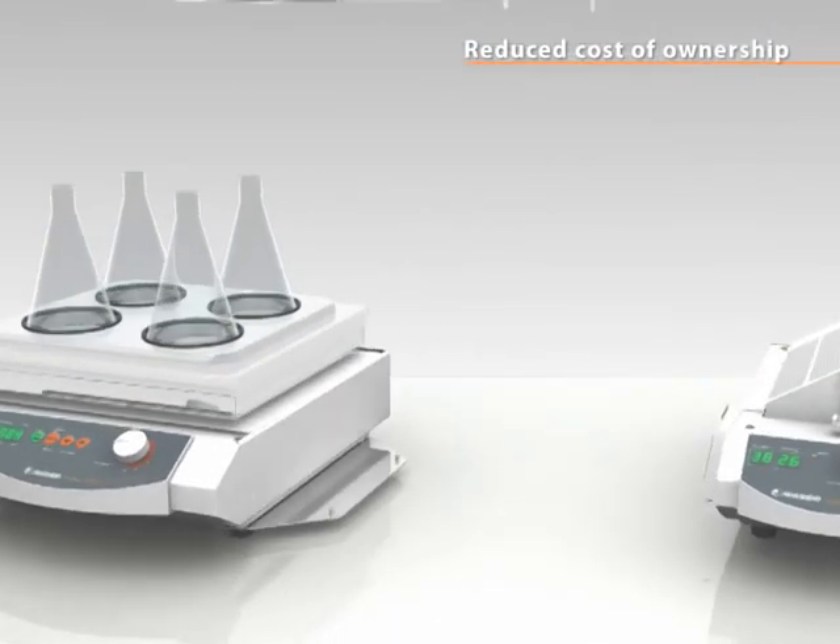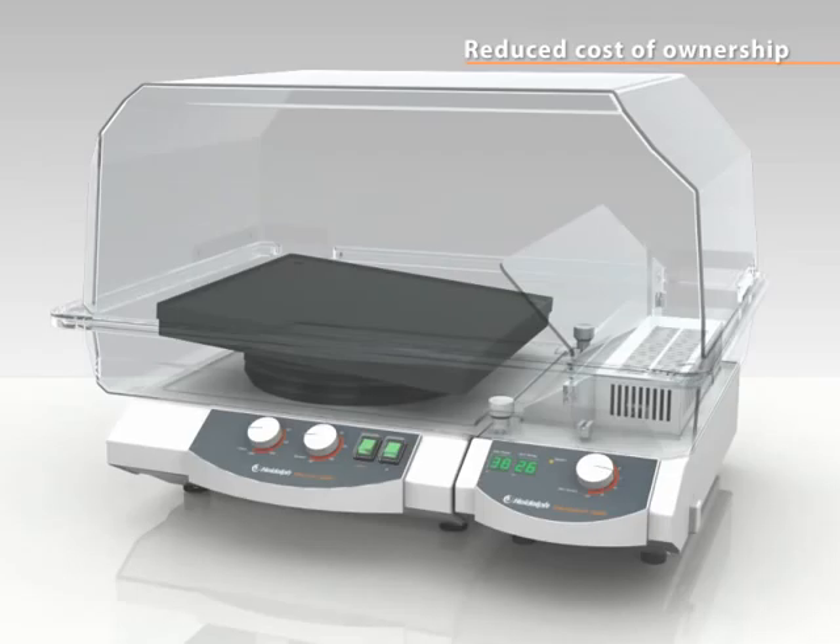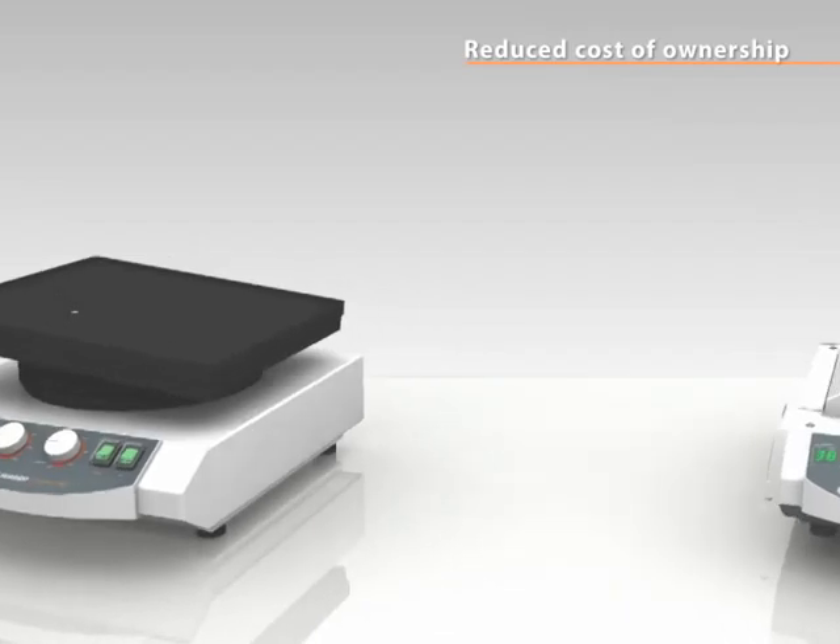Use one incubator for numerous shakers. Interchangeability is ensured and takes less than two minutes. You can incubate and mix simultaneously or independently.